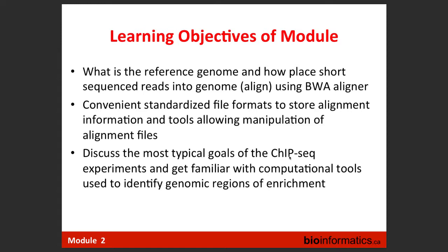So the learning objective is written here, maybe you saw it already. We will discuss what we do with the reads after a sequencing experiment, in order to arrive at some biology. Not maybe the final biological analysis, but some biology. How to identify those regions which are enriched in ChIP-seq experiments.